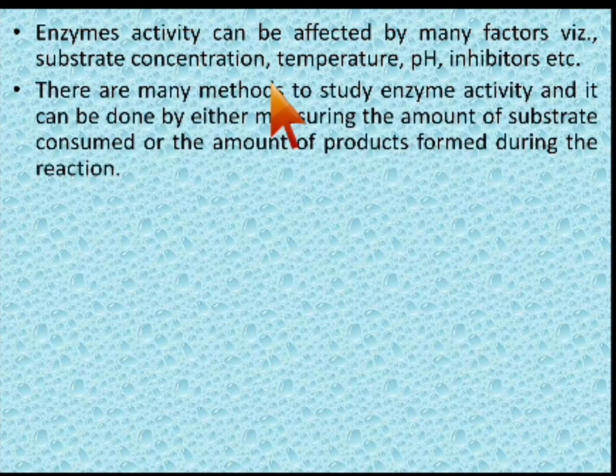And there are many methods to study enzyme activity, and this can be done either by measuring the amount of substrate which is consumed during the reaction, or we can study the activity of the enzyme by measuring the amount of products formed after the reaction.